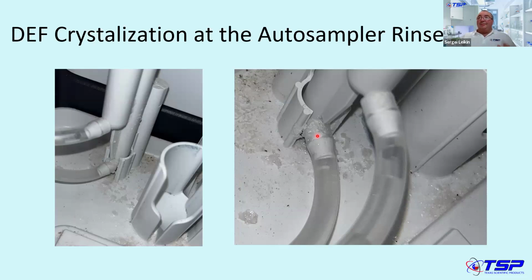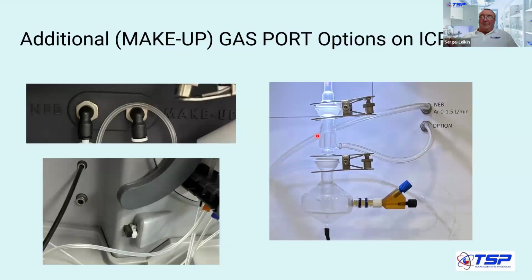So that is why, for this particular application, engaging the additional gas, I would say, is not a must, but definitely a very good thing to do. So you can run reliably.